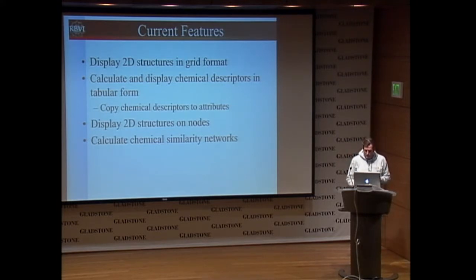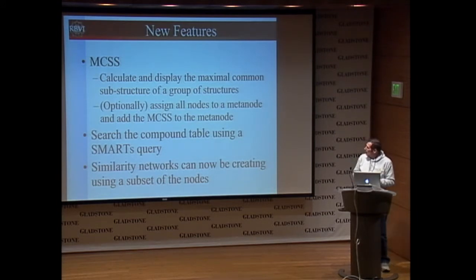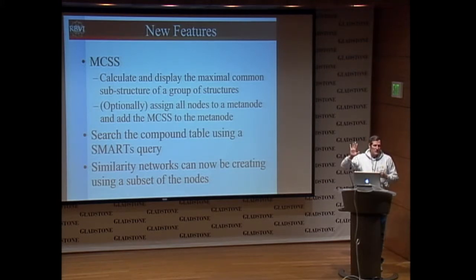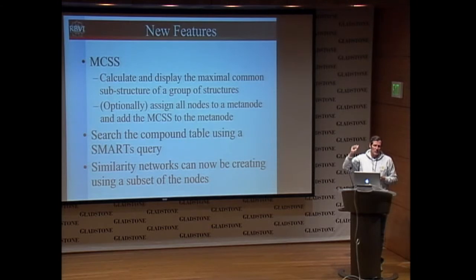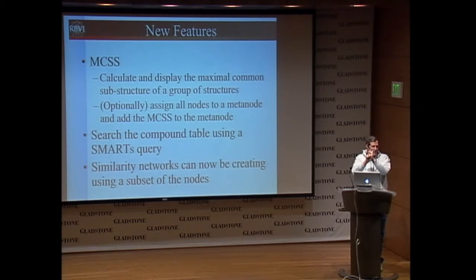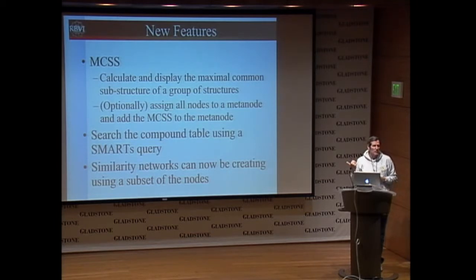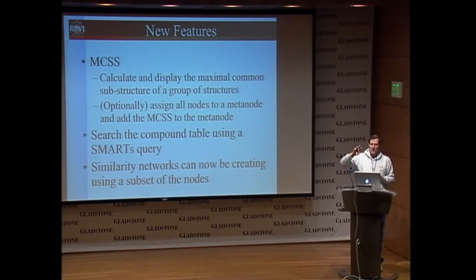What have I been working on? We've added the maximal common substructure capability. If I select a group of nodes and say show me the maximum common substructure, there's now the ability to calculate that. Optionally, I can create a MetaNode, collapse that group into the MetaNode, and affix the maximal common substructure as the SMILES string on the MetaNode. That gives a way to summarize dense networks with a series of MetaNodes. You can now also search the compound table using SMARTS, and you can select a small set of nodes and create a new similarity network with just those nodes.